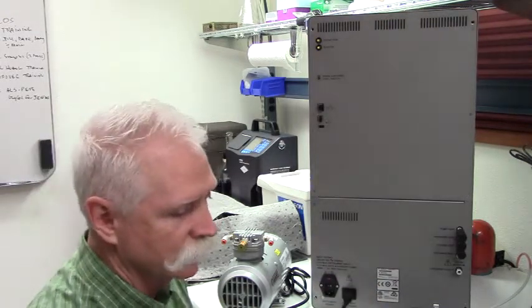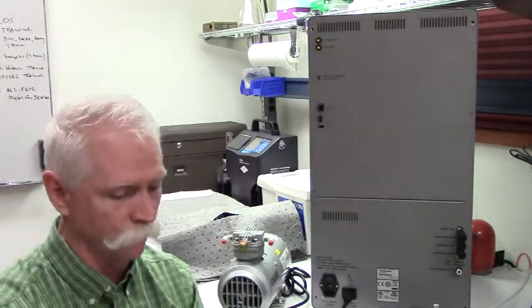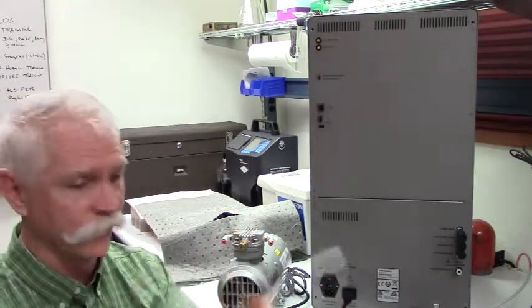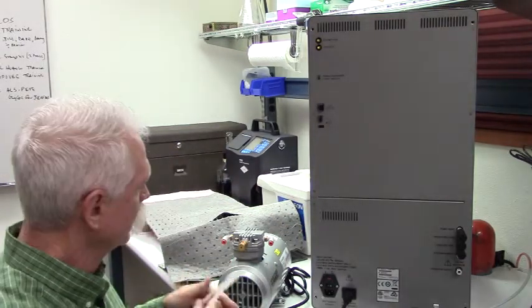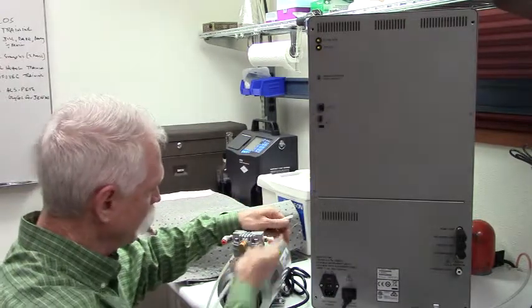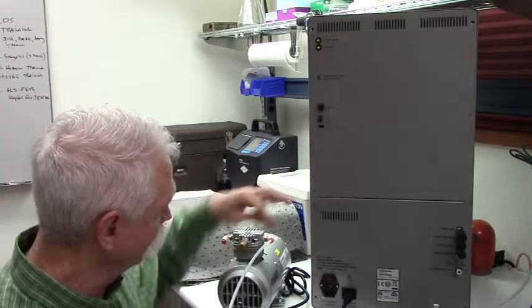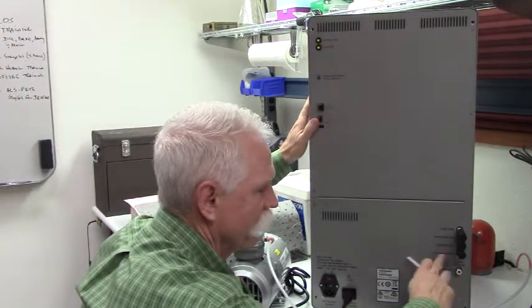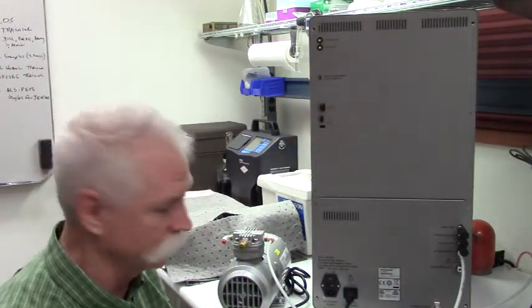Now we're going to connect the air system from the compressor to the instrument. The compressor comes with two sets of quarter-inch tubing for this purpose. You're going to take one piece of tubing and separate it from the other. Look at the compressor pump — mine is labeled vacuum and pressure. Take the vacuum side and fully engage that piece of tubing into the quick disconnect fitting. These fittings are already attached to the compressor for your convenience. Take the other end and press it into the vacuum supply port — fully seated. Once it's in, it's done.